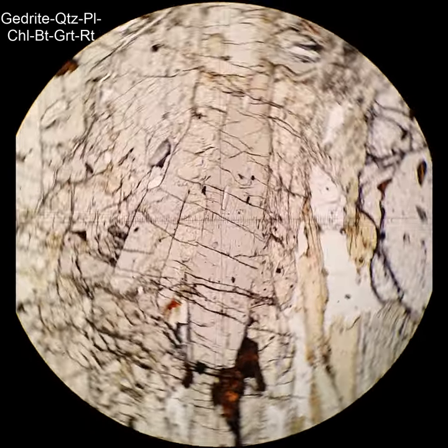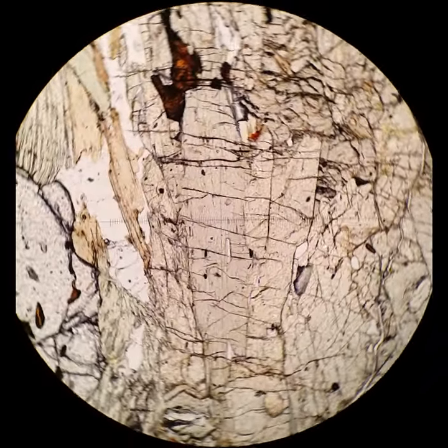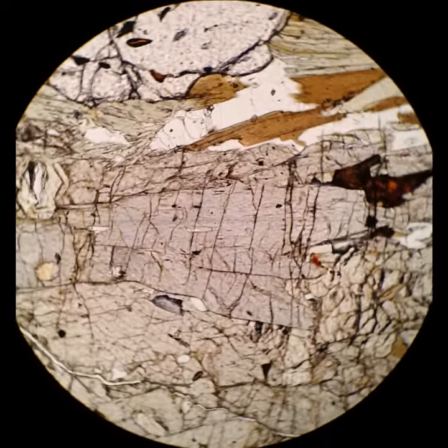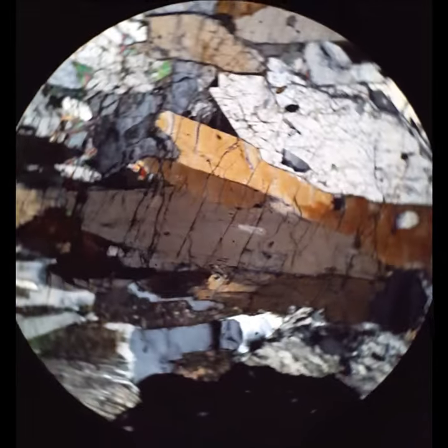Here you may see that the central grain has a gray pleochroism. It's faint, but that is characteristic of gedrite. When I cross the polars, you'll see it has parallel extinction — that's a really important characteristic, that's how you know it's in the orthorhombic system. Those end sections show really nice amphibole 60-degree cleavage, so that's one of the key characteristics that allows you to identify this as an amphibole.